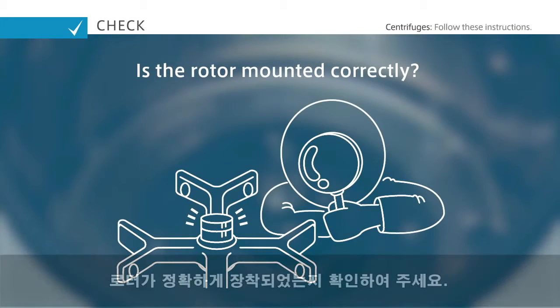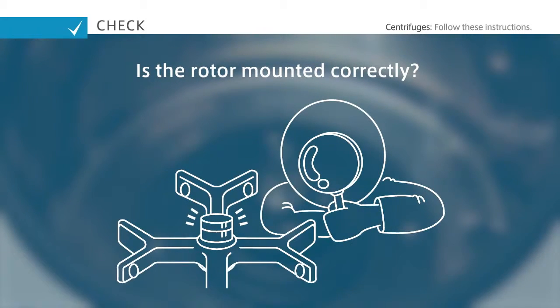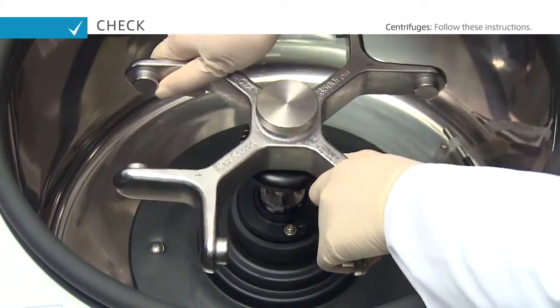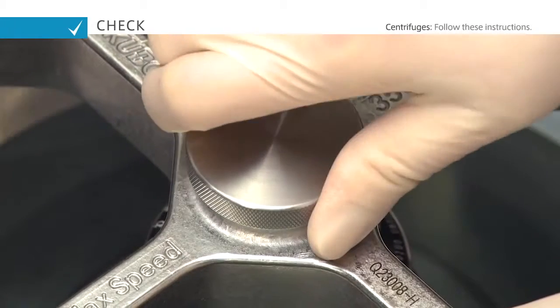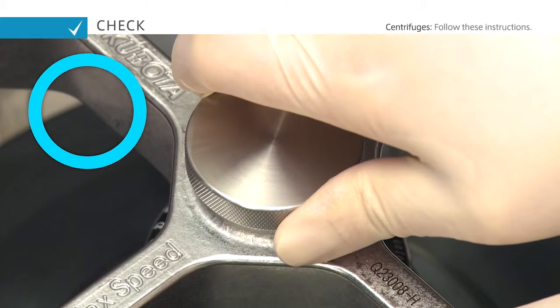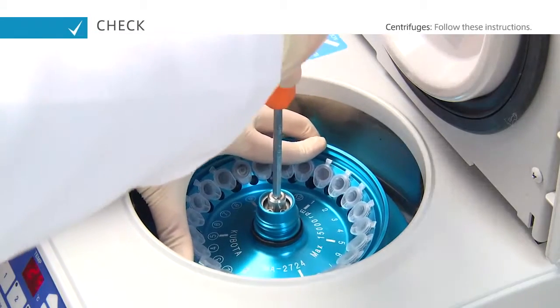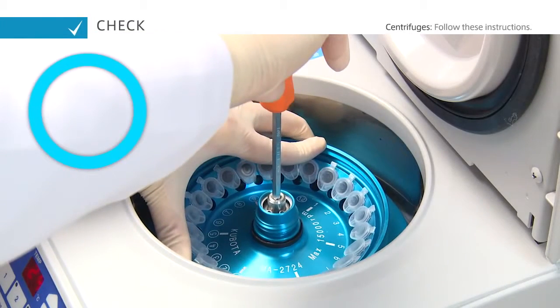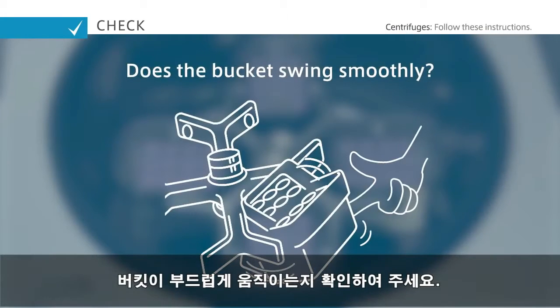Make sure the rotor has been mounted correctly. Make sure that the bucket swings smoothly.